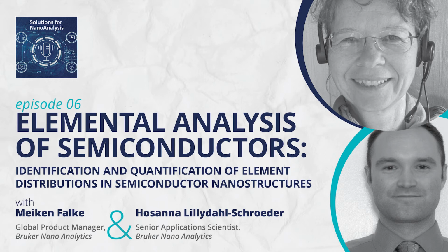And it is particularly good for TEM because of the low background. So EDS is absolutely ideal because of a high peak-to-background ratio for electron transparent samples. And TEM is needed for high spatial resolution. And therefore, EDS in TEM is the ideal tool and used a lot in the semiconductor industry.